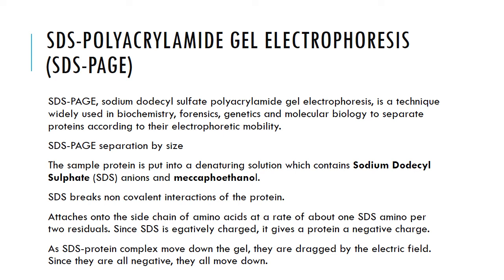This technique is widely used in biochemistry, forensics, genetics, and molecular biology to separate proteins according to their electrophoretic mobility.